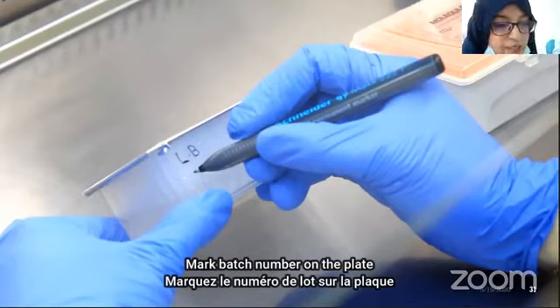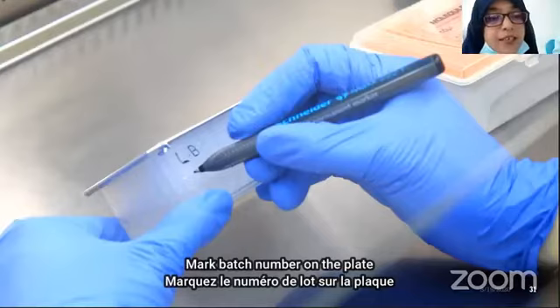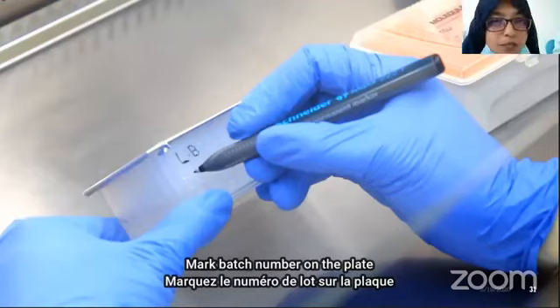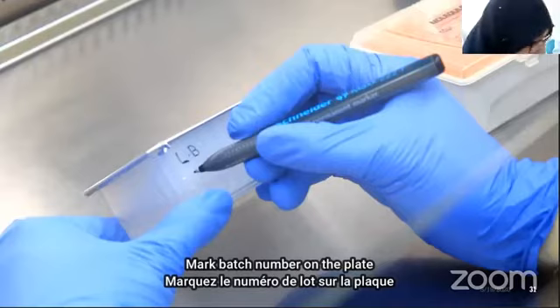and we can extract RNA of different types of viruses because these machines have different programs, like the hepatitis B virus program and the hepatitis C virus program. You can use the nasal swab sample, you can use the serum sample, you can use any type of sample. So principally, most of the samples can be used on these automation machines. But first you have to check whether these machines are a closed system or an open system.